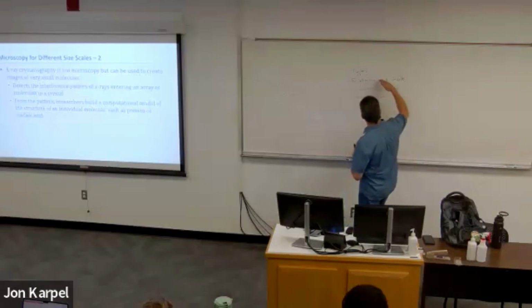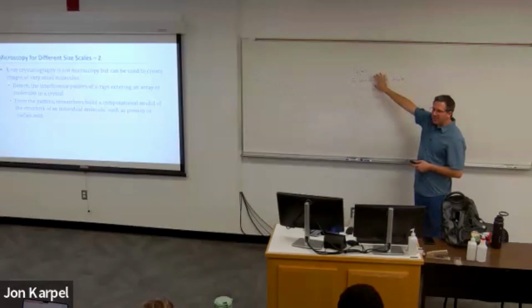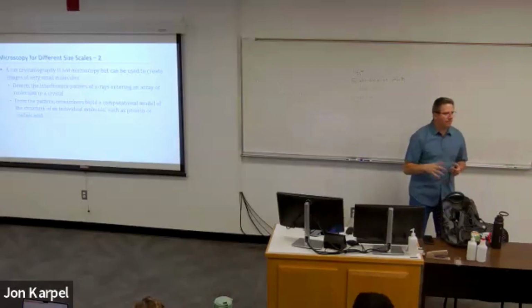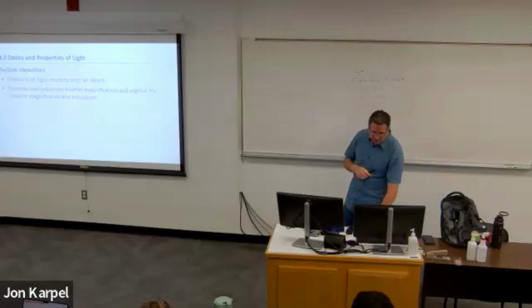So what do you need to know? Probably what the types are. The ones that we're going to use the most are bright field, and just be familiar with what's available out there, right? So far, so good. Okay. I have some questions for you later.